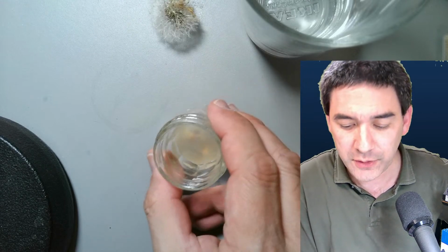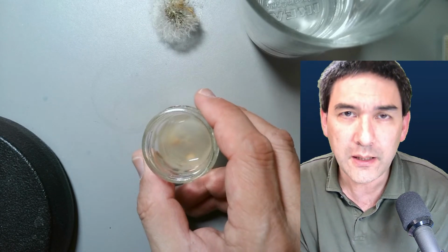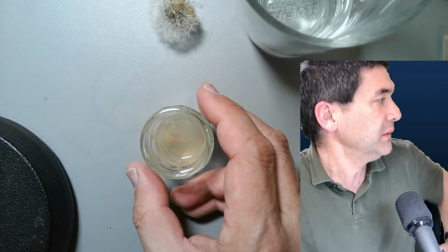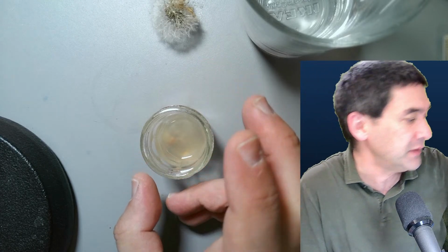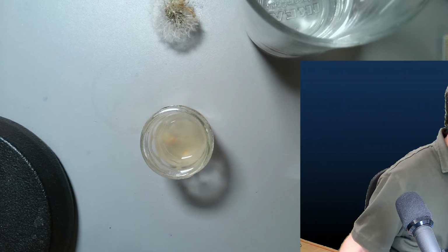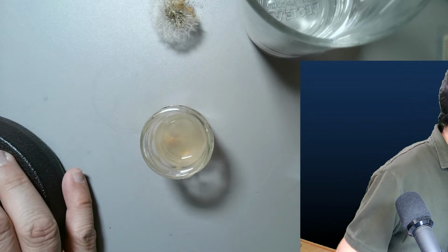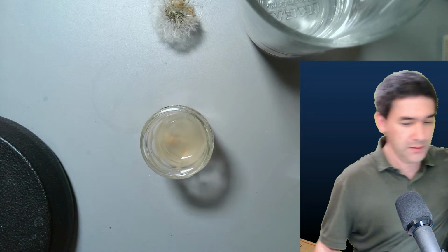You see it looks pretty yucky. It's slimy and so on. What I've done is added a little pond water, and I added a wheat grain. Let me see if I've got some more left for demonstration purposes. Here it is.